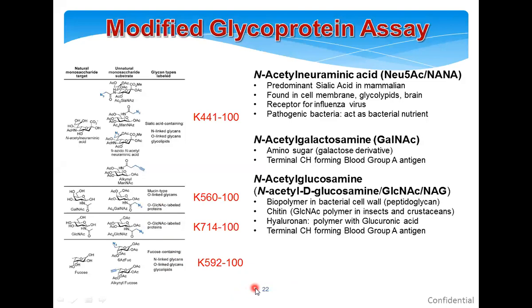This is for fucosylated proteins. Suppose you want to study any fucose-modified proteins, fucosylated proteins, so you use that.